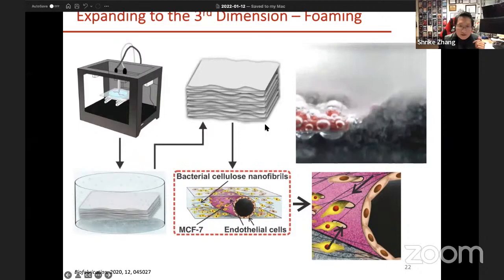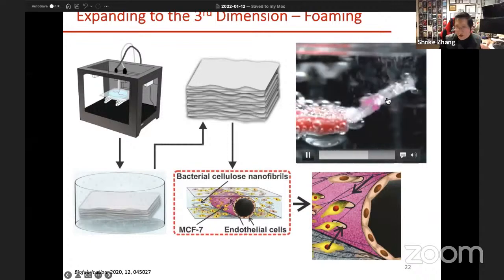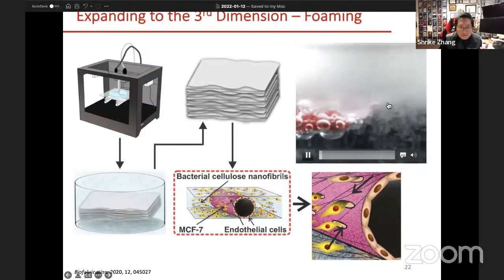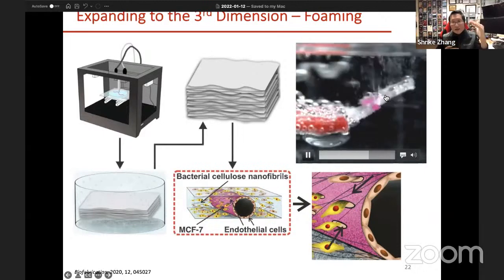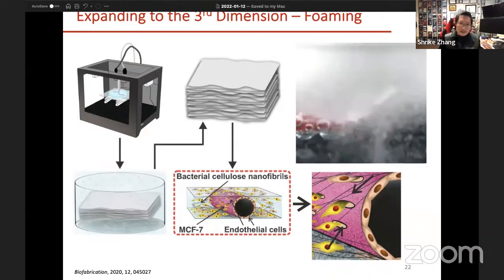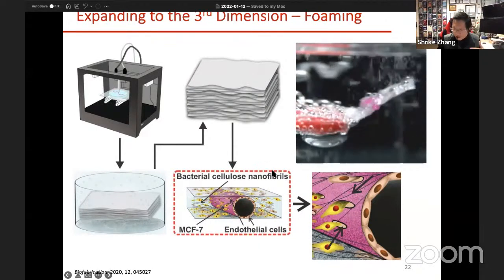What's interesting here is that if you soak this device into a solution of sodium borohydride, and then allow bubbling to happen, it's going to effectively expand this paper device into a 3rd dimension and create all the microscale pores that are connected within the 3-dimensionality to really allow better interactions of different cell types within the whole model that you're going to create.